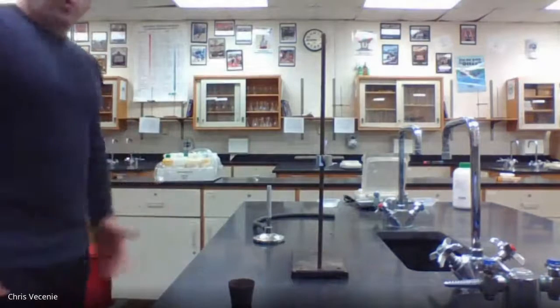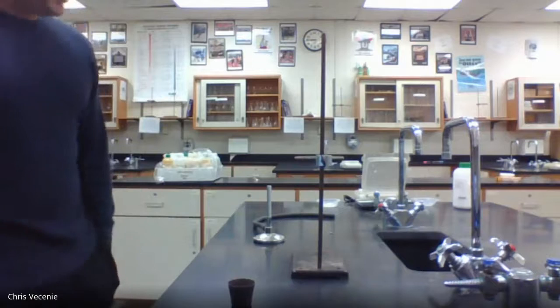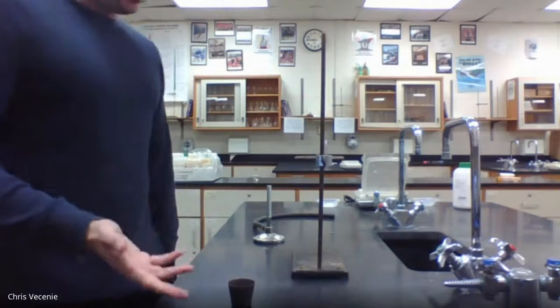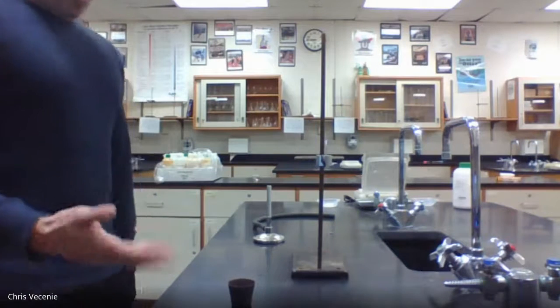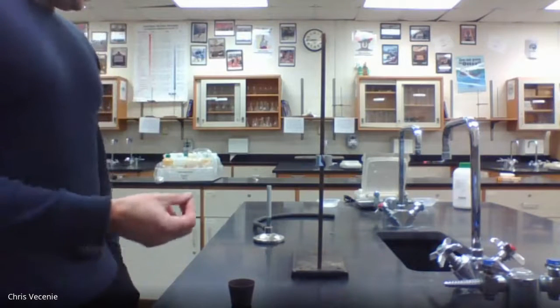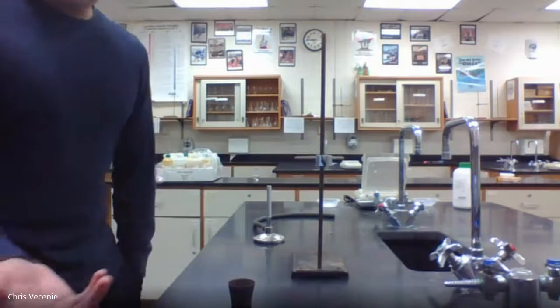All right, now we start walking through the procedure, which I'll share with you on the screen, and we'll try to go back and forth. The first thing it tells me to do is to heat this guy strongly for 2 minutes. We want to make sure there's nothing on this or in this, no water, nothing like that. Okay, all right, so I'm not even going to get the mass of it yet because I want to make sure if there's any junk on it, it goes away.